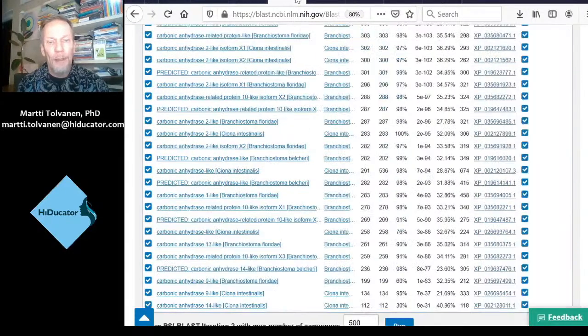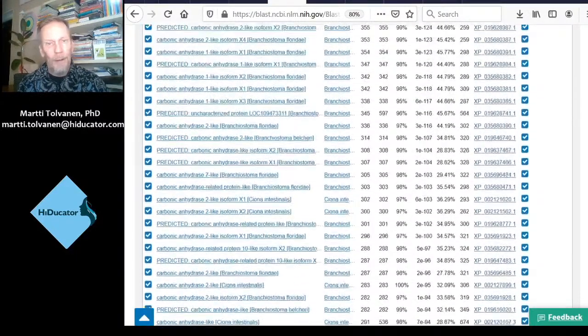And now in DELTA-BLAST, what we get is even better scores and very good E-values for this lowest scoring one too. Incidentally, the ordering of the last few sequences has changed so that this one has dropped from last but one into the last position out of the 39.